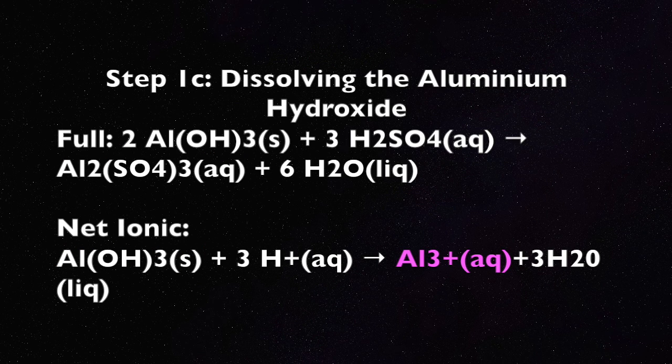This aluminum hydroxide is insoluble, as almost all hydroxide salts are, but will dissolve upon the further addition of the remaining sulfuric acid, as seen in the reaction below. Soluble potassium, sulfate, and most importantly aluminum ions are produced in this reaction.